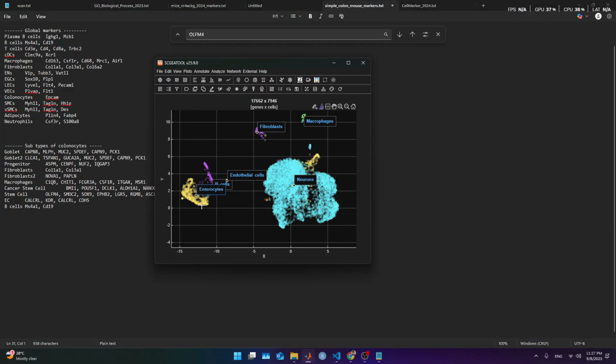So here, to find out what gene markers are here in enterocytes, those are epithelial cells as well. And these are fibroblasts, as we mentioned before, but those are different fibroblasts. If we do look for, in this endothelial were ECs, not endothelial, so that means this small branch is endothelial, but these are ECs. Oh, the ECs are endothelial cells, my bad.